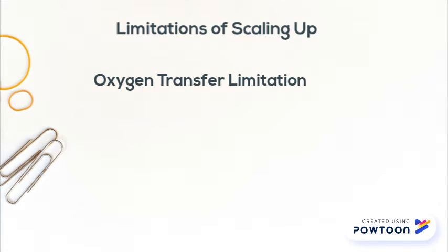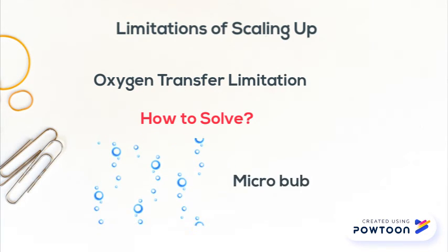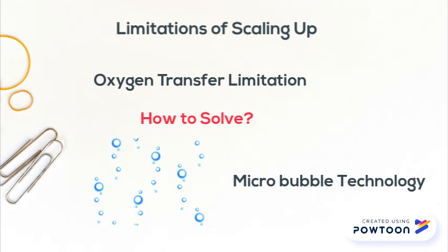Another limitation encountered is oxygen transfer limitation. A proposed solution is to introduce microbubble technology and soluble surfactants in order to meet cellular oxygen uptake rate.